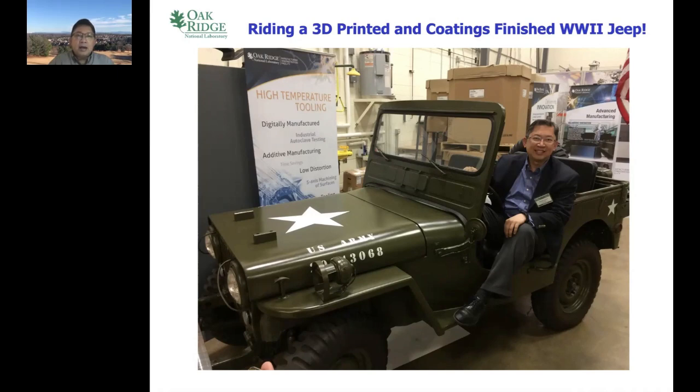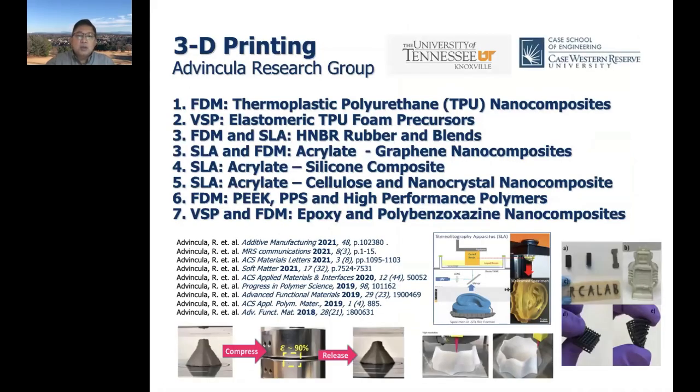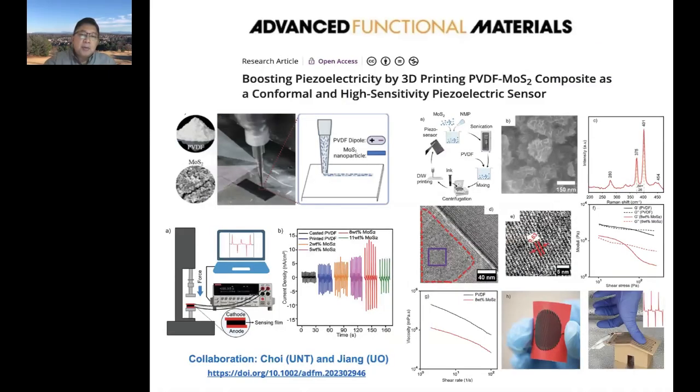And in fact, in our laboratory, we have 3D printing capabilities of various techniques that allow us to produce and observe nanomaterials and nanocomposites towards manufacturing. So in this case, 3D printing has the advantage of being more useful when the object is more complex or has a higher performance. So we've been busy in our laboratory doing investigation of polymer nanocomposites as they are applied to 3D printing, and that includes characterization of their properties and reporting their phenomena.